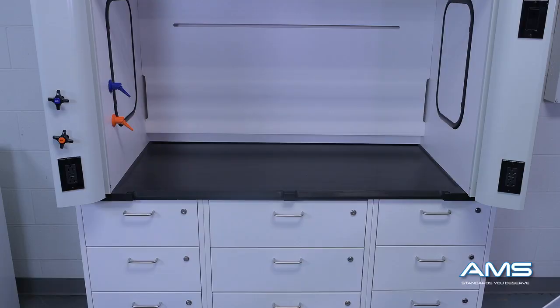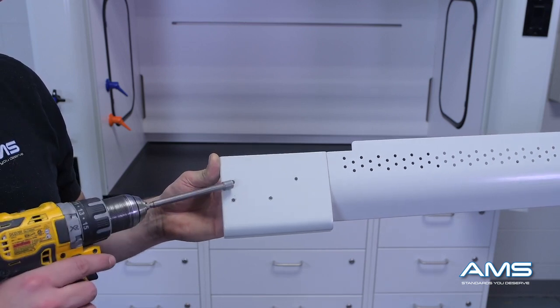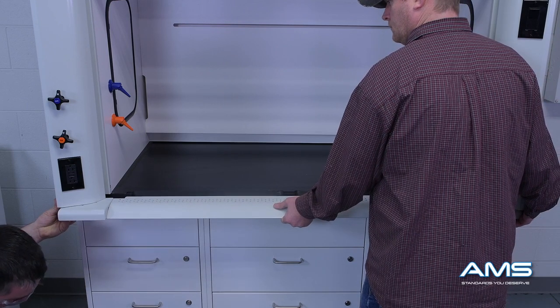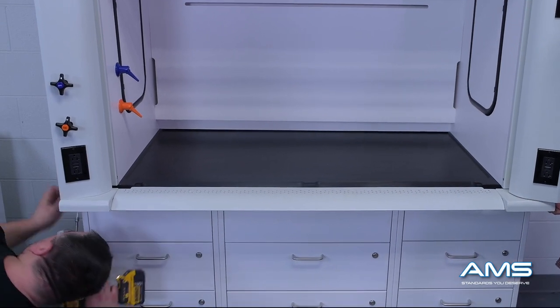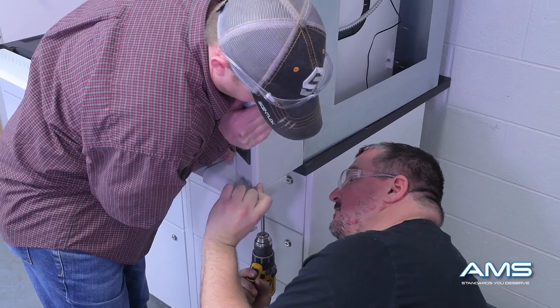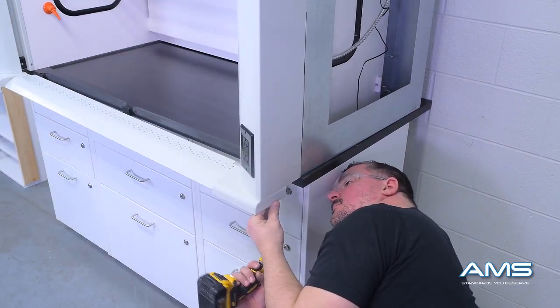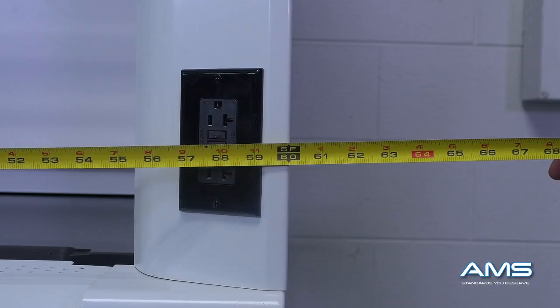Next, place the airfoil onto the fume hood — this will also help with alignment. Notice the pre-tapped holes on the airfoil; use these to attach it to the underside of the hood. Line up the holes and drill your screws into the hood, making sure all are in the correct position. Repeat this process on the opposite side. As you can see with the airfoil attached correctly, everything aligns perfectly — a 60-inch hood should measure 60 inches from edge to edge.